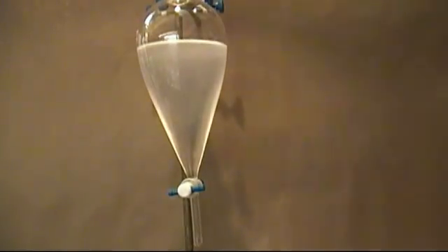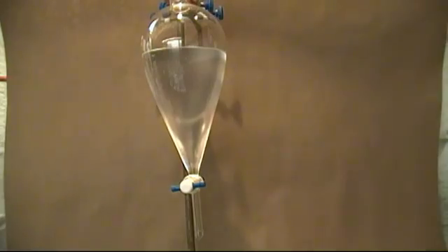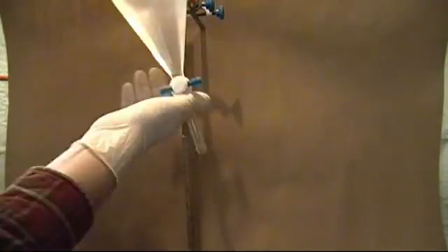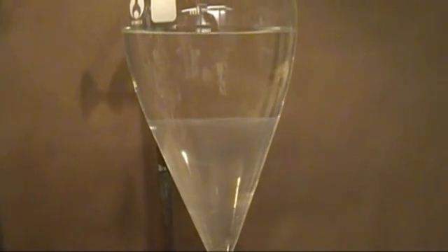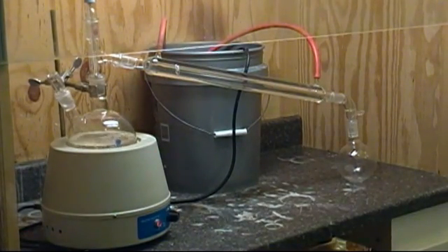When done, I let it set for a few seconds — sometimes it'll go ahead and form two layers. If you have a flask big enough to hold everything, you can distill all of this. If you don't, you can get it to form two layers by adding a saturated solution of salt and water. This will force it to separate into two layers and help pull out any water and ethanol from the ether layer. After setting for 30 minutes, you can remove the bottom water layer and discard it or distill it. Ether is slightly soluble in water, so if you do distill it, you'll recover about 15 to 20 milliliters of ether.